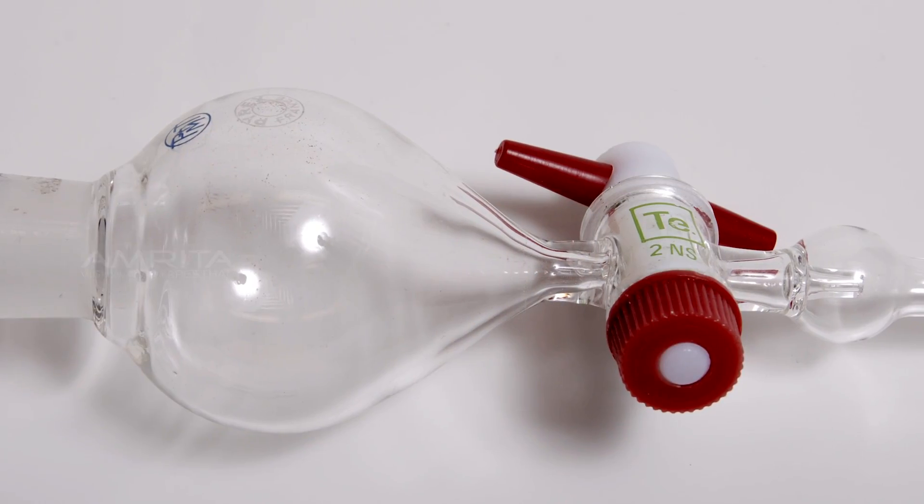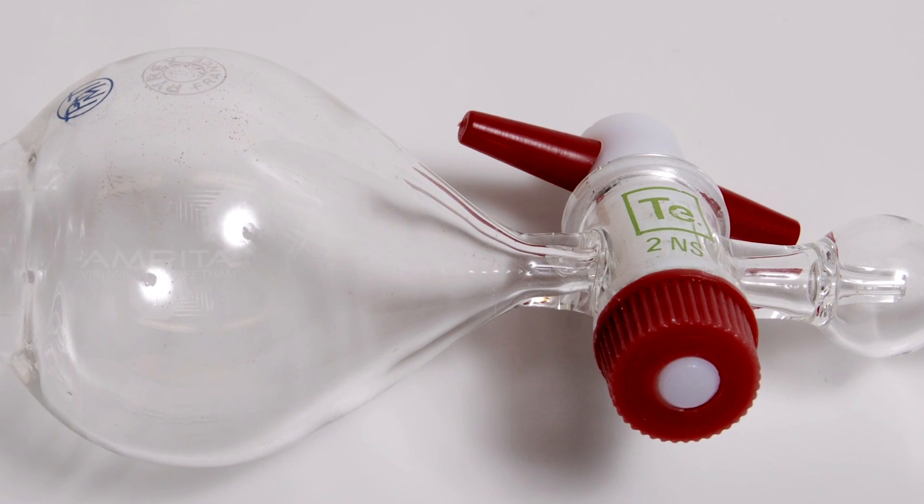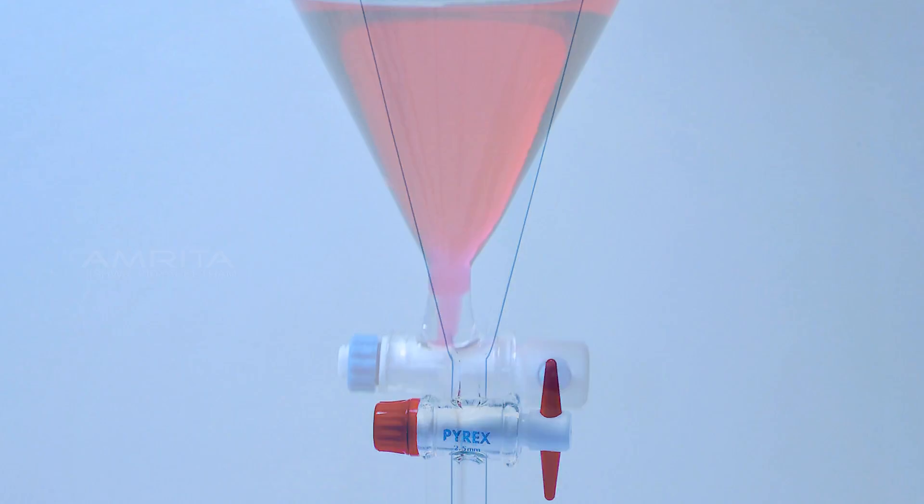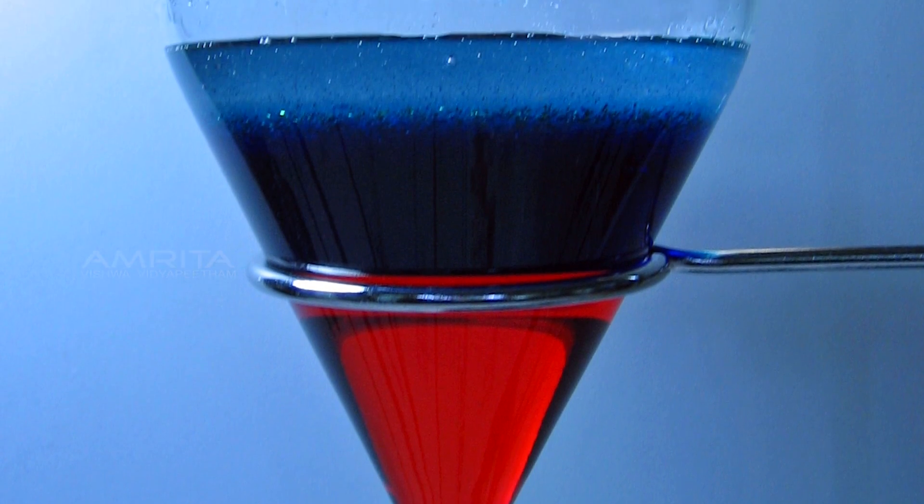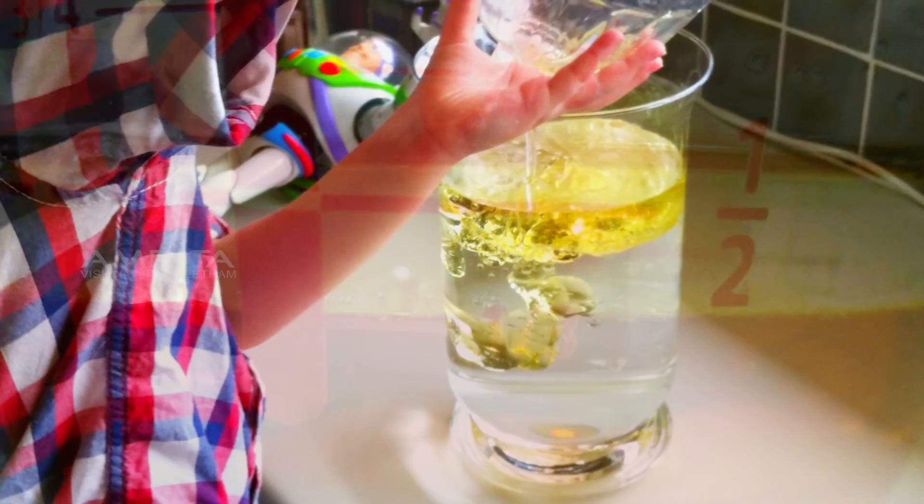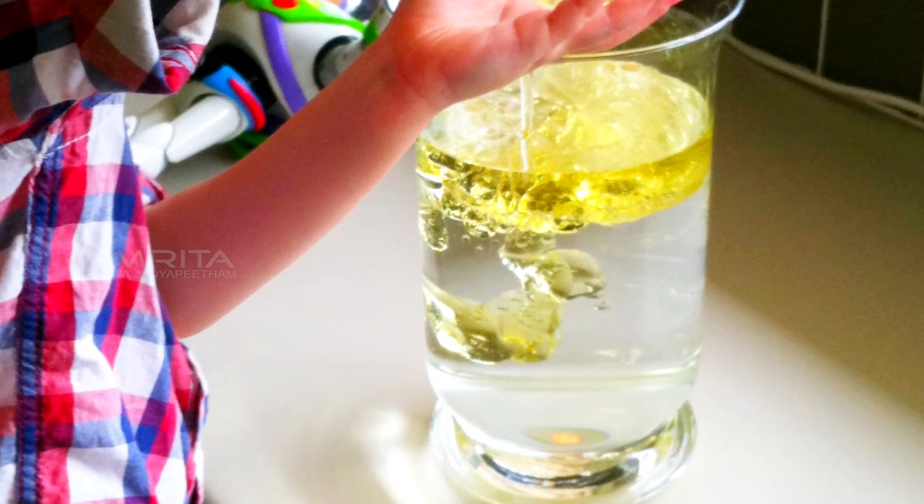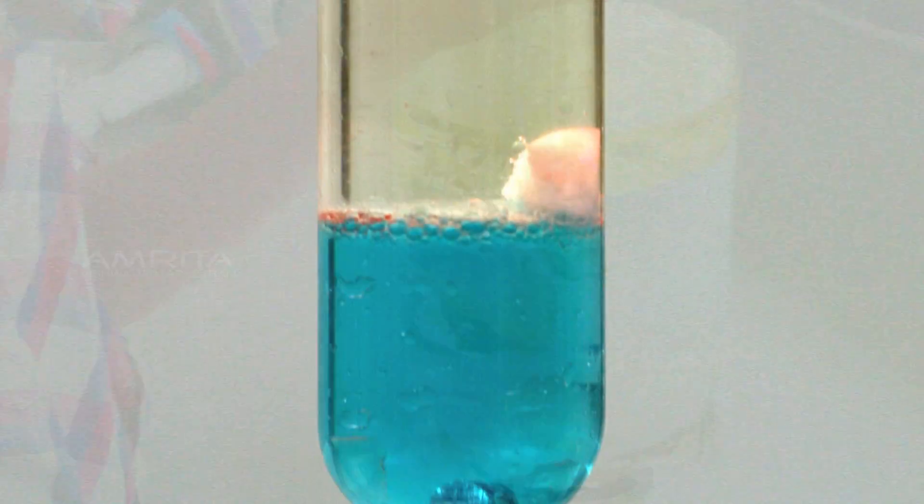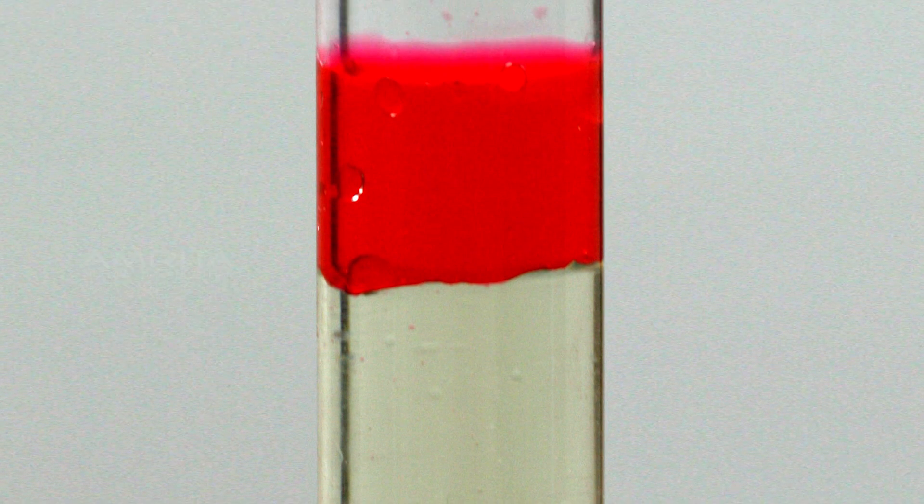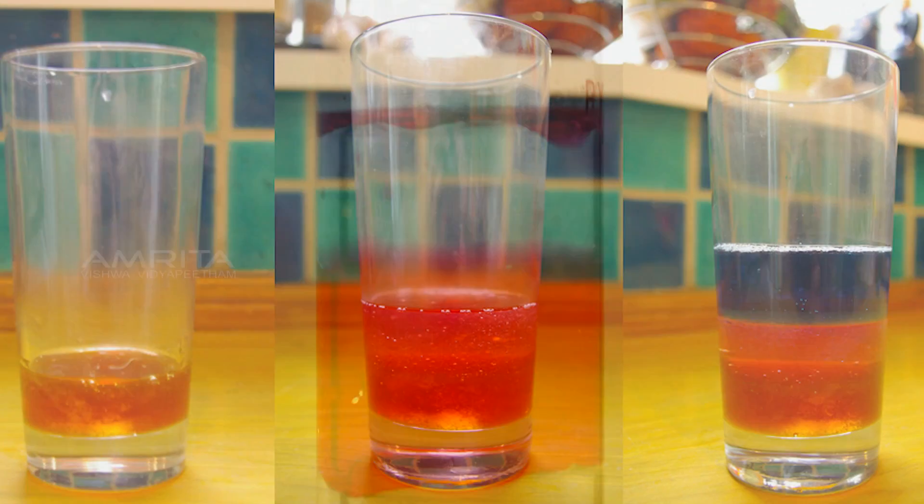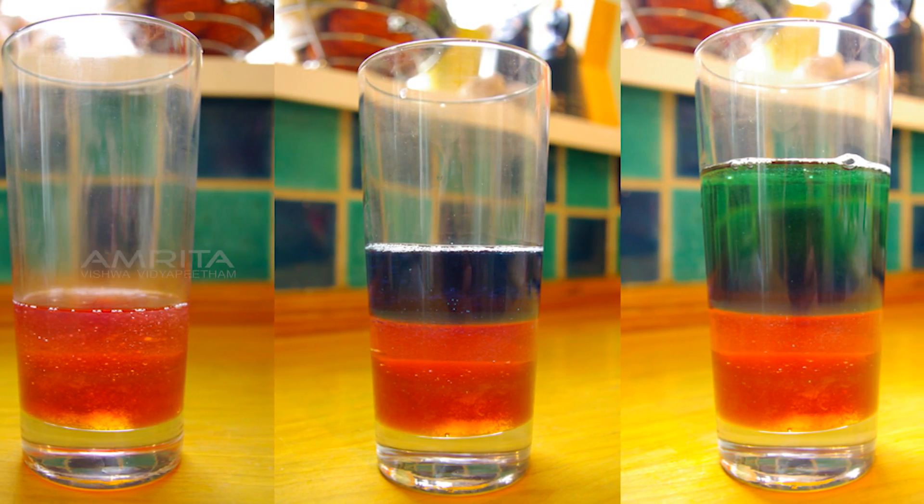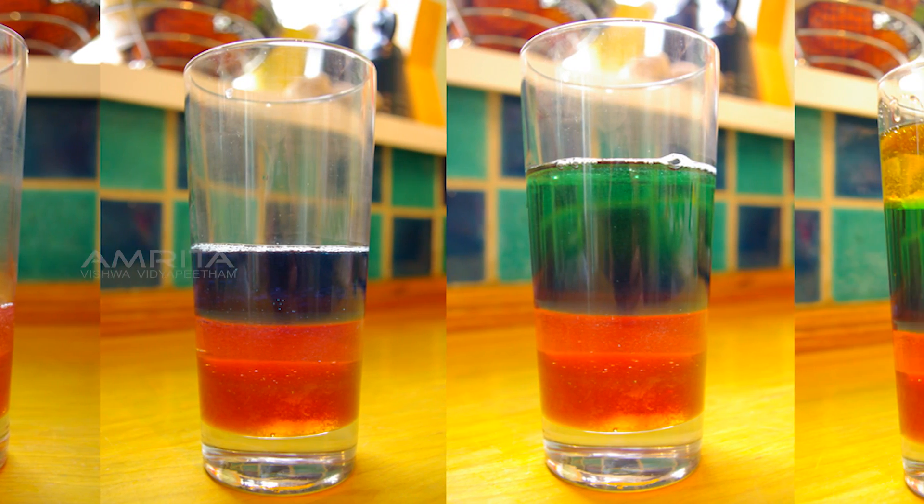Separating funnel is one of the techniques that is used for separating the components of a mixture between two immiscible liquid phases. One phase is the aqueous phase and the other phase is an organic solvent. This separation is based on the difference in the densities of the liquids. The liquid with more density forms the lower layer and the liquid with lesser density forms the upper layer.